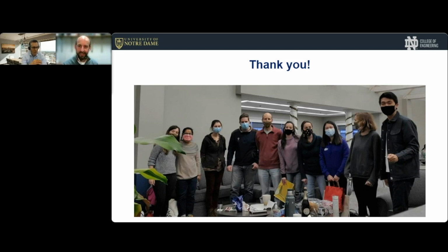Again, thank you. The next question comes from Jana Safarik from Orange County Water District. What is the lowest resolution? So maybe I'll chime in here. With Thorlabs OCT equipment, the resolution depends on the system that we decide to use for the application needs. And the best resolution that we can achieve at the moment is 3 microns axially, so vertically in air. And this has to be divided by the refractive index. So for water, this would be in the range of 2.2 microns. And what we have to distinguish here is lateral from axial resolution, because those are separate in OCT. And laterally, we can go down to 4 microns with catalog equipment. With dedicated equipment, this could be even better.